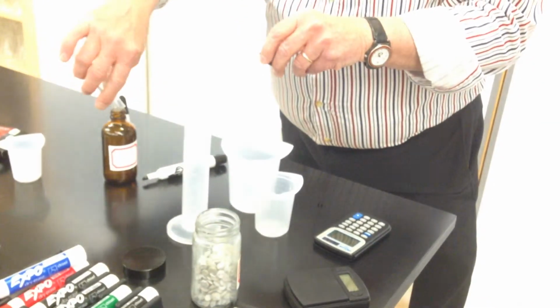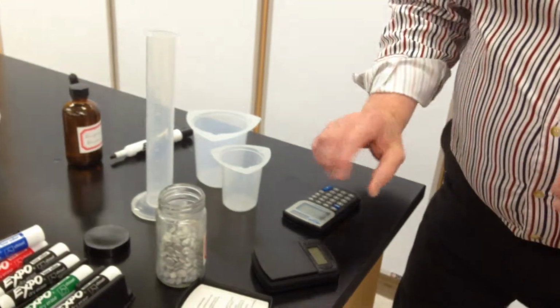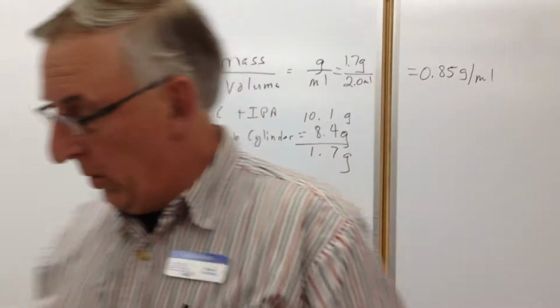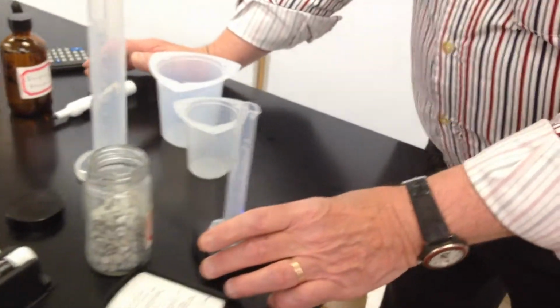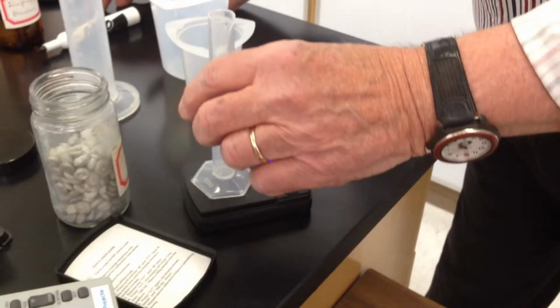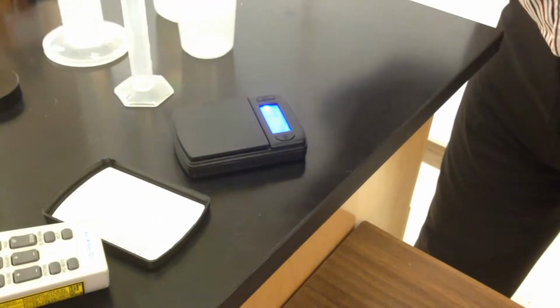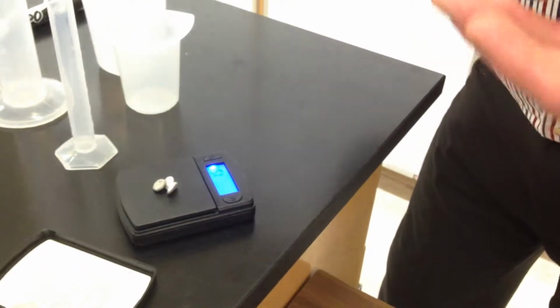All right. Now, for a solid, so that's for our liquid. Now for our solid, we're going to put it on the balance again. This is just aluminum, which is what I've got set for this experiment, but you could use any metal, but I'm going to just weigh the aluminum first.